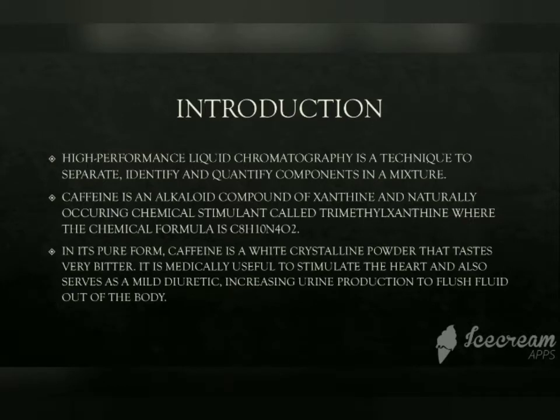High-performance liquid chromatography is a technique to separate, identify, and quantify components in a mixture. Caffeine is an alkaloid compound of xanthine, a naturally occurring chemical stimulant called trimethylxanthine, where the chemical formula is C8H10N4O2.